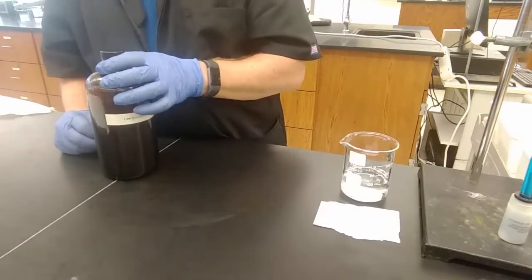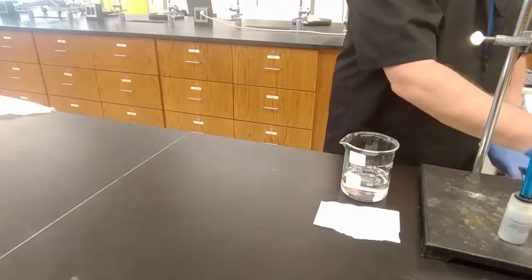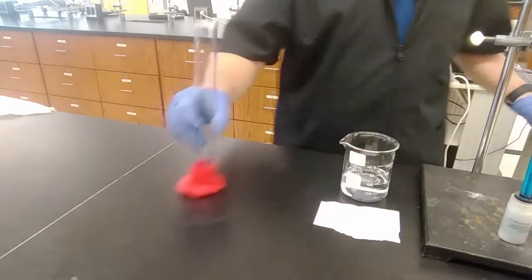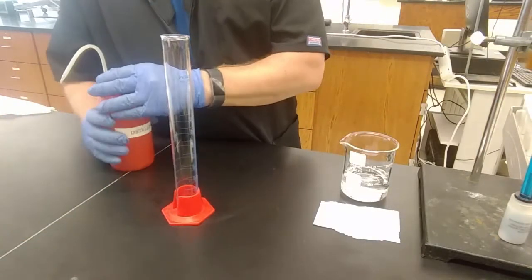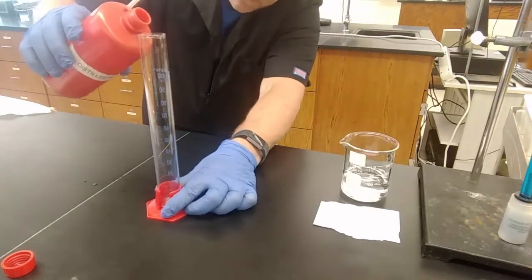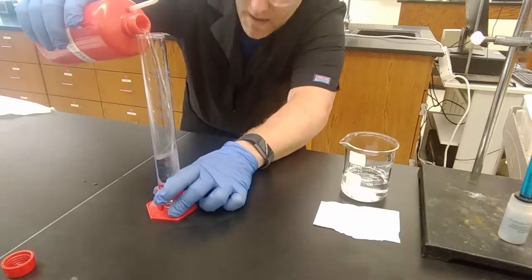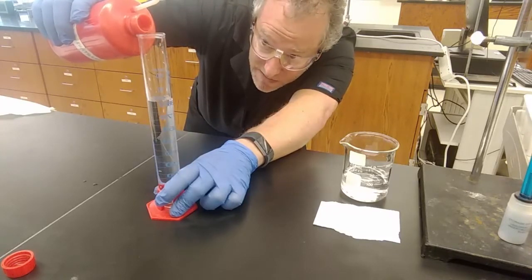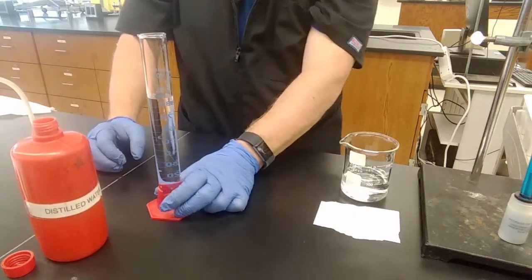Okay, I'm going to take 90 milliliters of water using a 100 milliliter graduated cylinder, because I want to get a little bit more precision in this one, and put it in another 250 milliliter beaker. So, get my graduated cylinder, get the 90 line down to eye level, and do I need to use a pipette? Let's see if I can get it exact. Done. 90 milliliters of water.